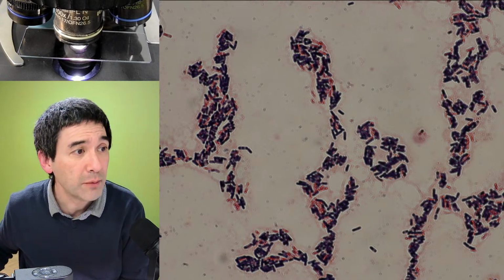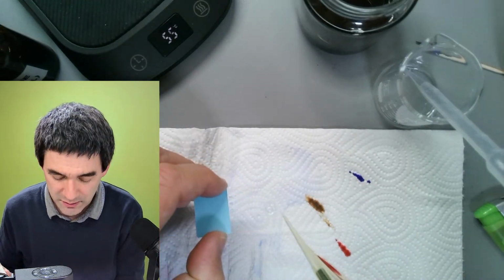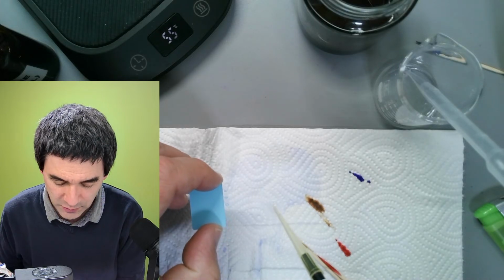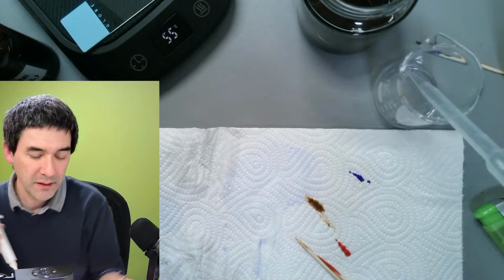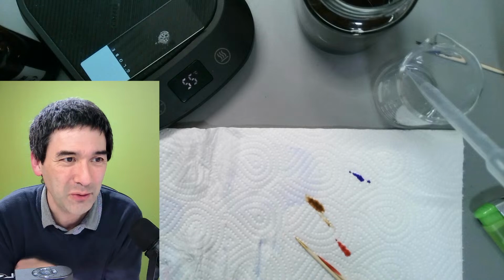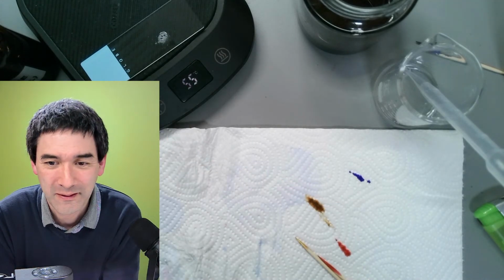you couldn't see this now because of the desk. Here it is. Here's my saliva. Unfortunately it makes foam, and I'm going to put it on here again, and I will tell you the following: there will be probably a lot of body cells from my epithelium on here as well. You can already see that it's starting to dry up.